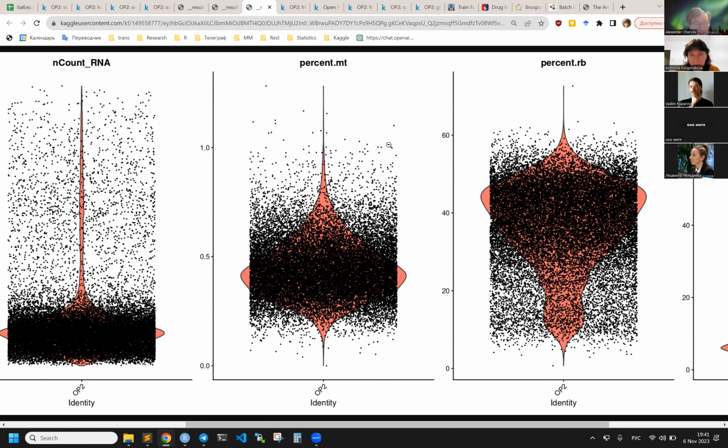Yeah, it's actually really strange. Maybe it's related somehow to the methodology, how they measured single cell data. I don't know. Usually in the previous competition we saw like 30%, and we were thinking about filtering cells below some percent, maybe 10.